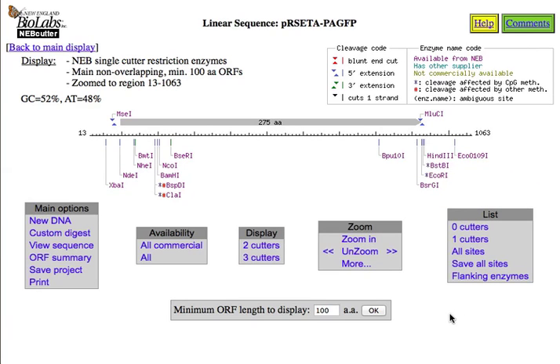It is possible when doing cloning, if you're going to make a fusion protein, you can take your protein of interest, in this case the PLC gamma, and put it at the N terminus of your target protein. So that would be over here. Or you can also put it at the C terminus, which would be over here. How do you know which one to use? Well, the unsatisfying answer to that question is you don't until you try and see which one works the best. Sometimes if you clone at the N terminus, it disrupts the protein, so in that case you would not be able to use it. Sometimes if you clone at the C terminus, it disrupts the protein, so you wouldn't be able to use it then.